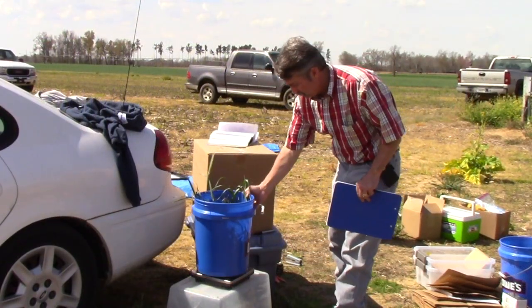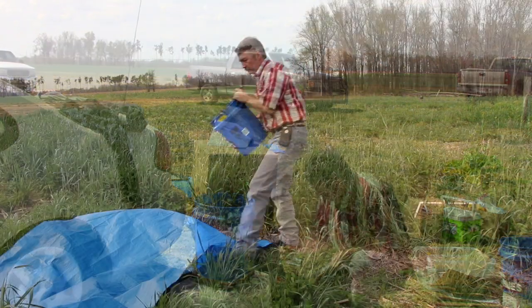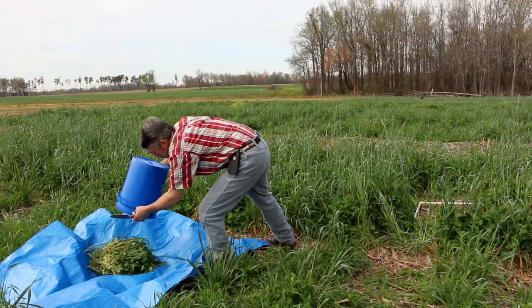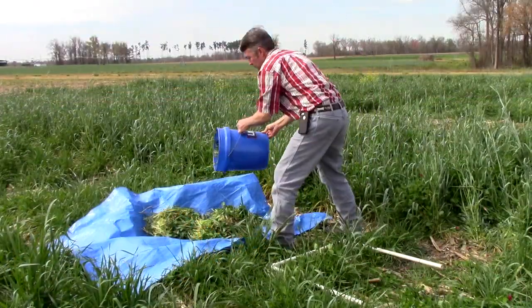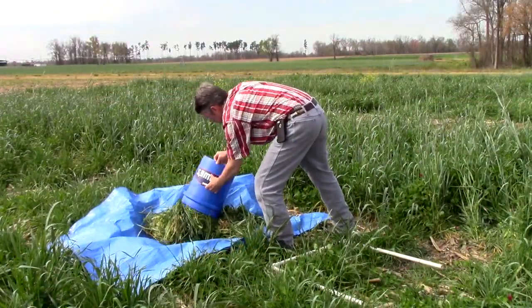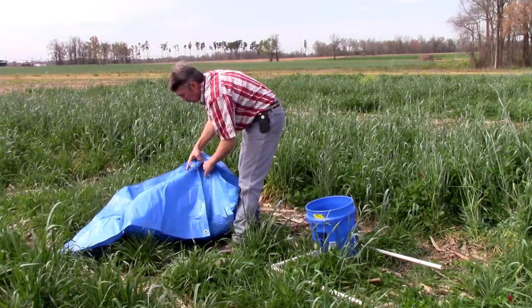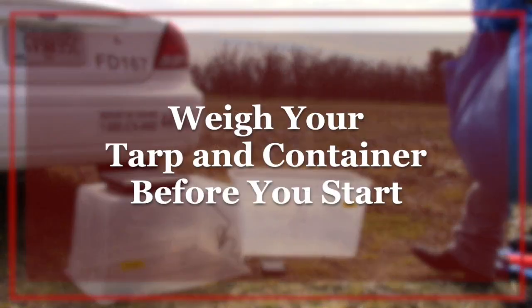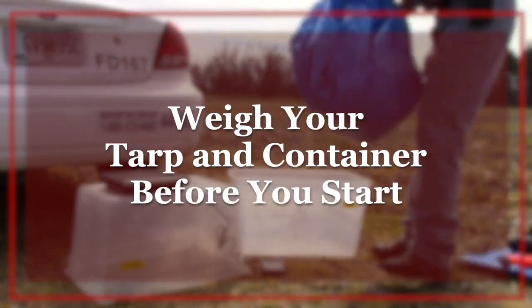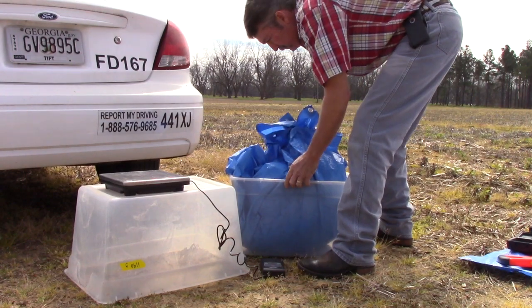You can weigh each subsample collected in the bucket and record the weight or place your subsample on a tarp to composite the samples for a field or section. Then go collect your next subsample. Repeat until you have taken all the subsamples that you need to take. When you are weighing your sample, make sure to write down the weight of the tarp or bucket the sample is in.